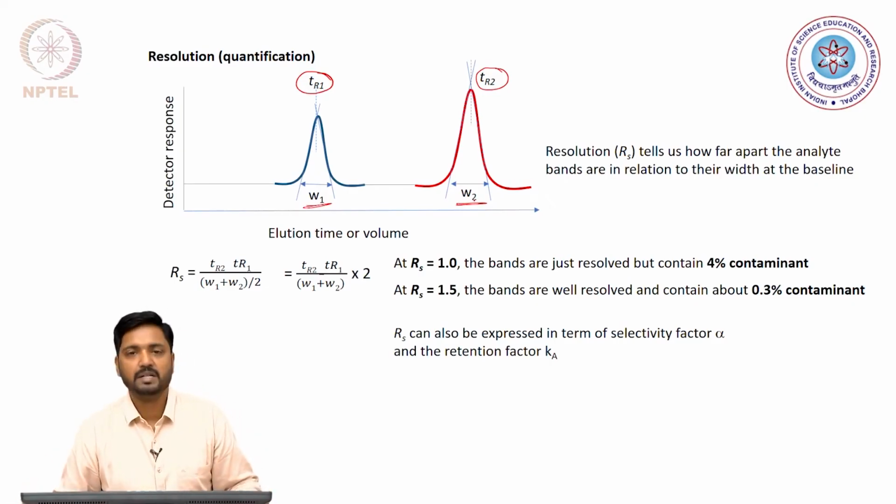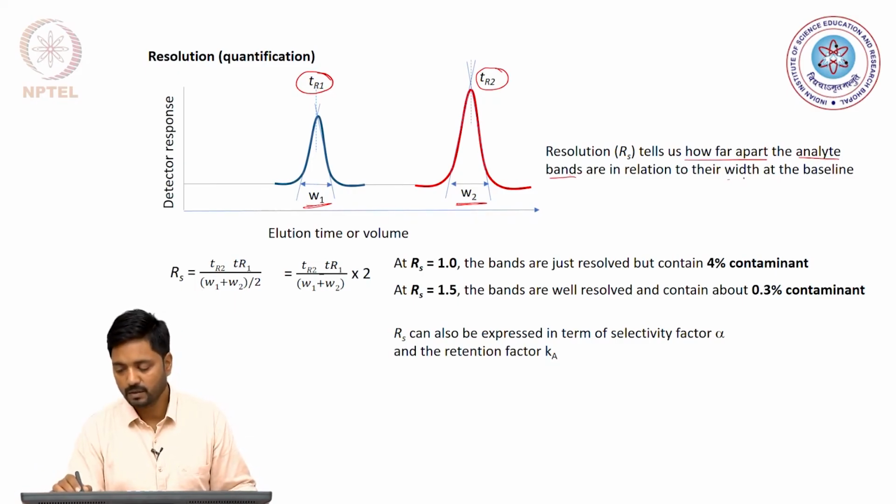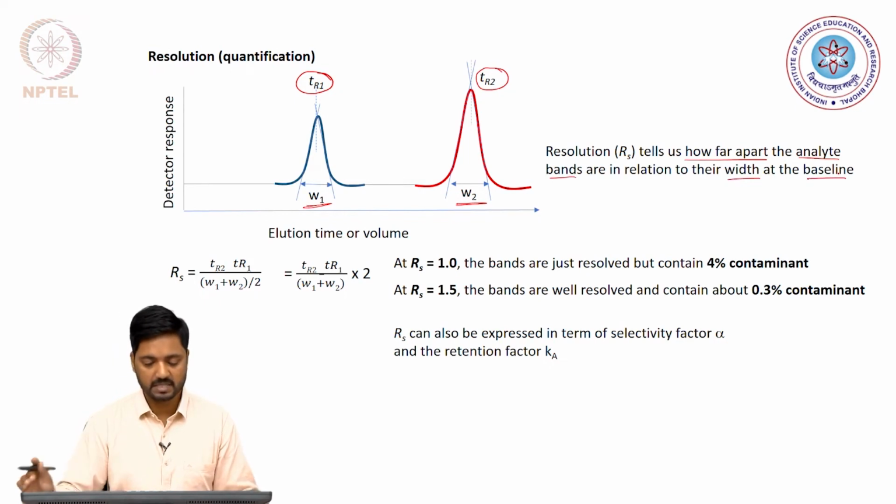By resolution we want to inform the reader or the researchers as to how far apart the analyte bands are with respect to the width of the bands at the baseline.